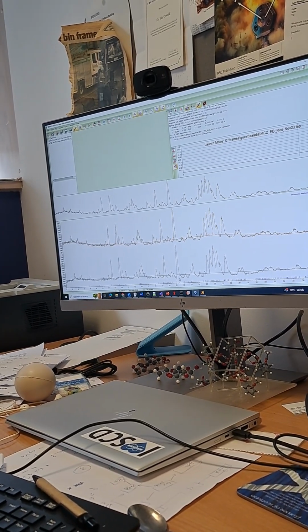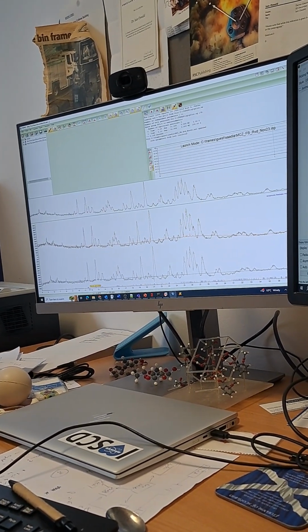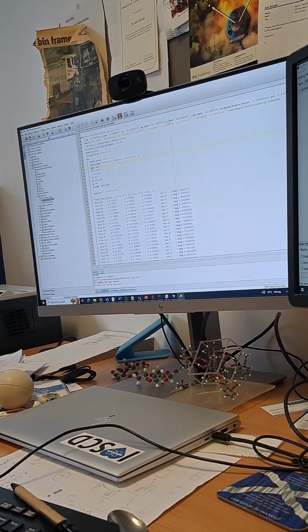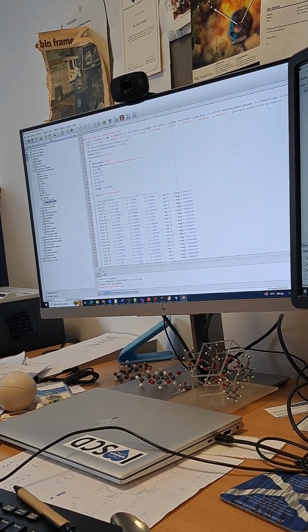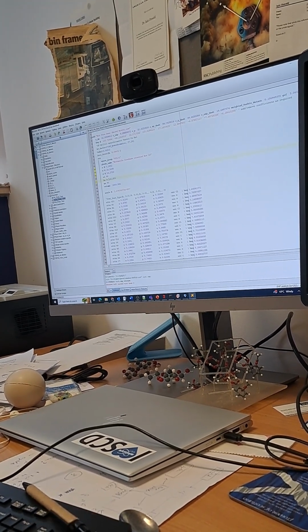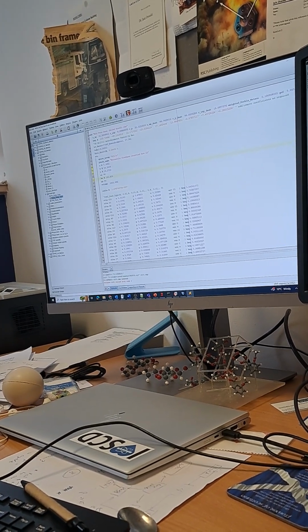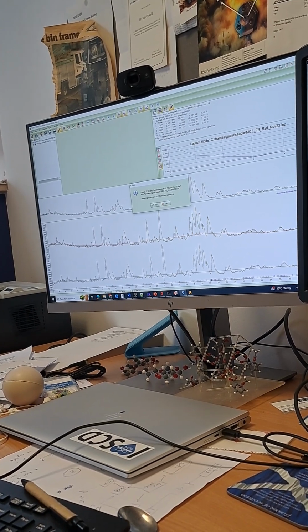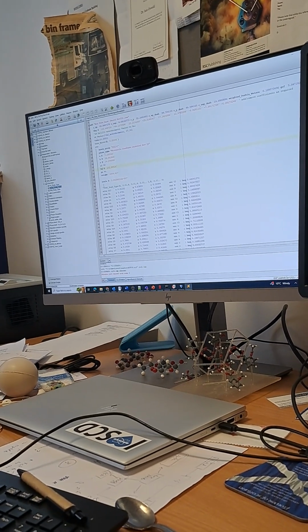Our cell parameters are going to be taken from the earlier fit, I don't know, but we're quite close. So what I'm going to try to do now is just get this going. It's good to have this, because if you've already done this at home with ambient pressure and ambient temperature, you'll already have this. So you only need to do this once. You only need to muck around with it once, which we've done in the past. So we're going over things again a little bit, but you can see by refining that it's not done anything. It's really not shaking up everything.